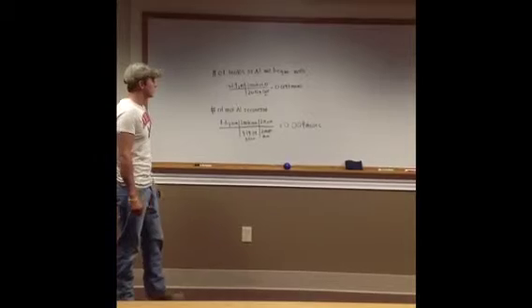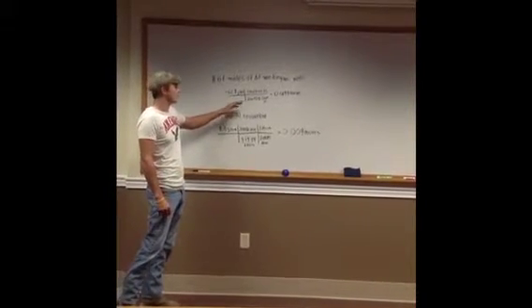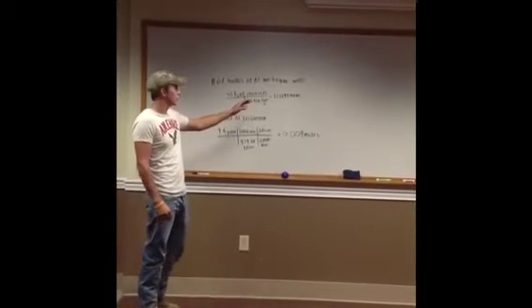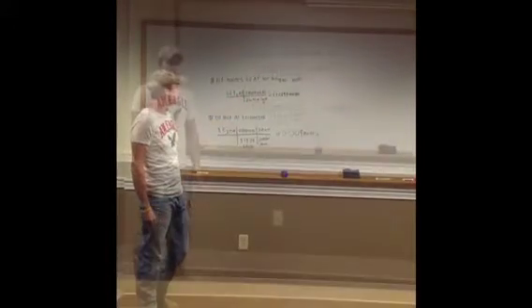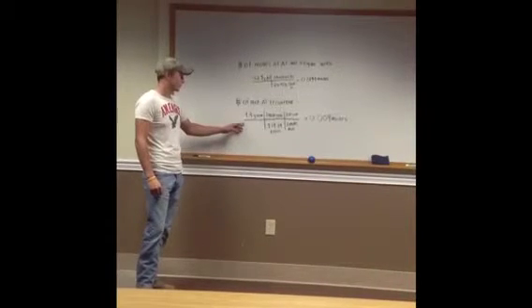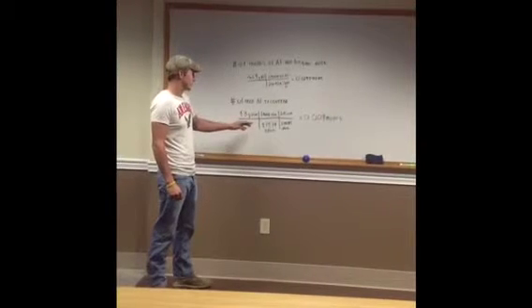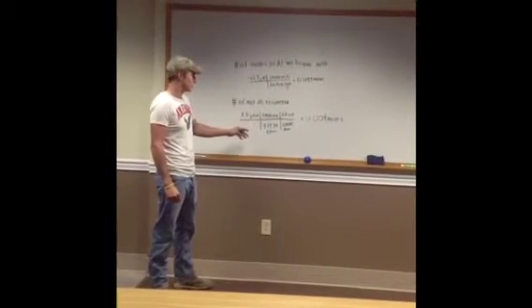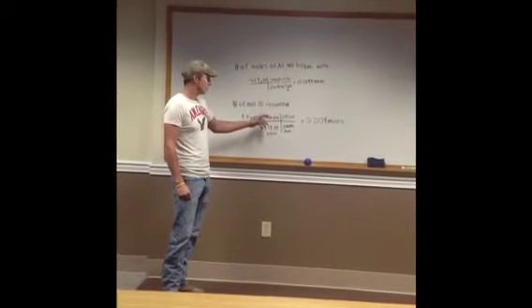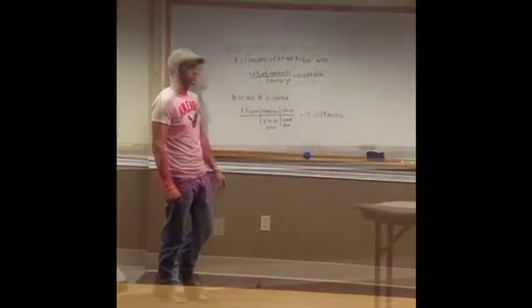The number of moles of aluminum we began with: we took the 0.524 grams of aluminum and divided it by the molar mass, which is 26.98 grams, and came up with 0.0194 moles. To come up with the number of moles of alum recovered, we took 4.3 grams of alum that we came up with in our experiment and divided it by 474.39 grams, which is the molar mass, and then multiplied it by 2 moles of aluminum and divided by 2 moles of the alum to come up with 0.009 moles.